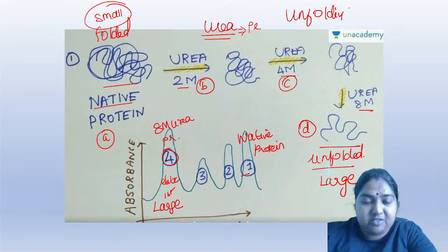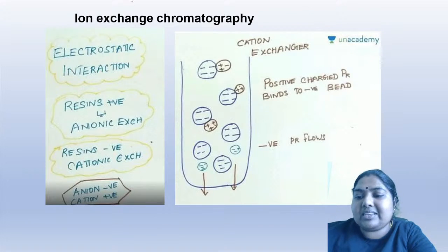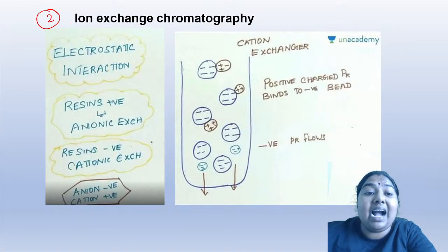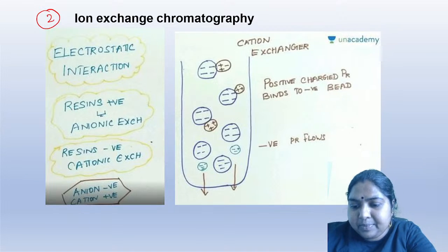Got it? Fantastic. So now we are going to see the second chromatography. This is another important chromatography. It is called your ion exchange chromatography. Seriously, this ion exchange chromatography is a very, very important one. So let us see that in detail.